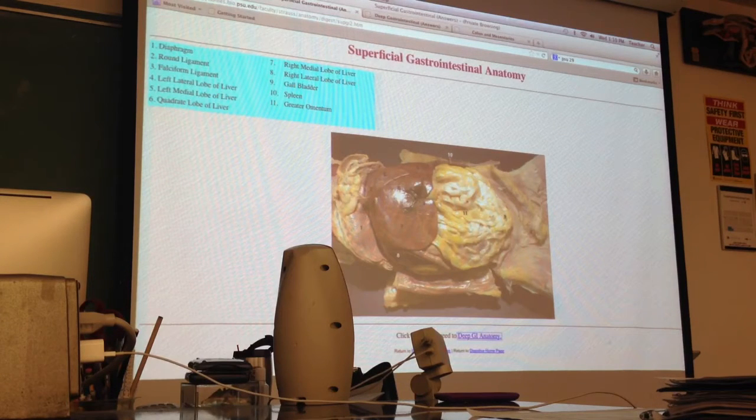When you opened it up, I told you not to touch the big fatty membrane. That's the greater omentum. Okay? So now that we're getting into the dissection portion, we need to see what's underneath it. The best thing to do is just kind of gently pick it up, starting at the edges, and work your way over. It's going to be pretty embedded and tucked into those small intestines, so try to do your best to keep it intact, because as soon as you get a couple rips in here, it just wants to fall apart. Okay? And if it does fall apart, that's totally fine. It happens all the time. Do your best to keep it intact. If not, anything that comes out, just put it in the cat pits.